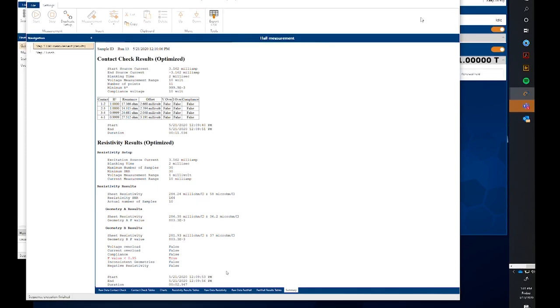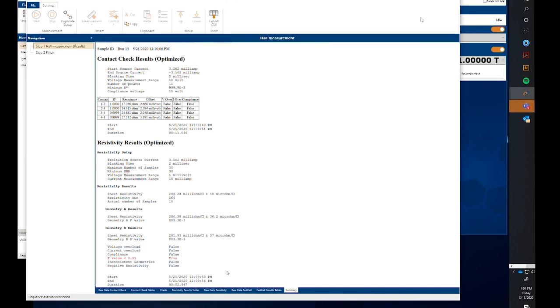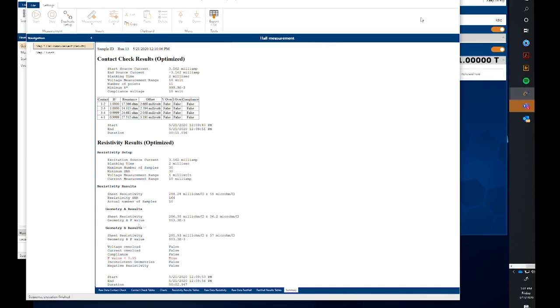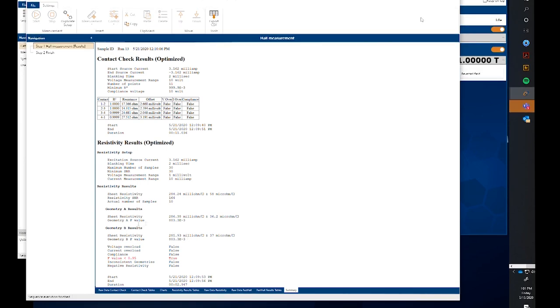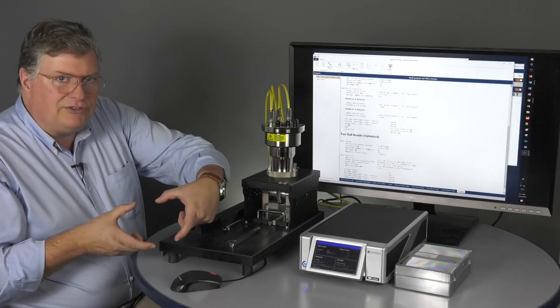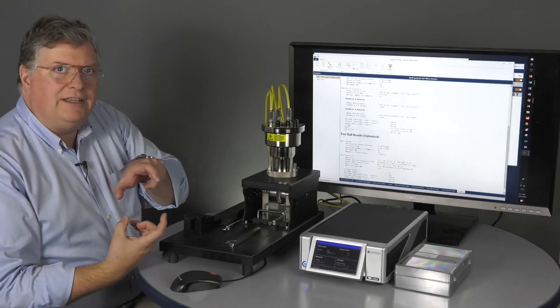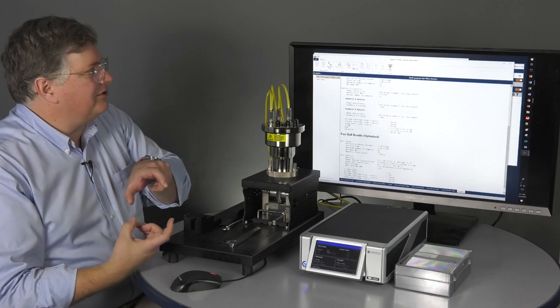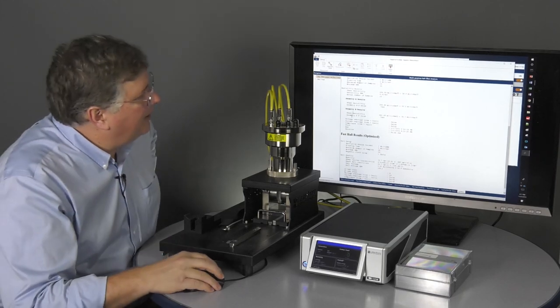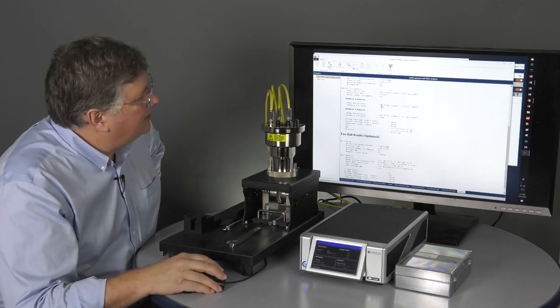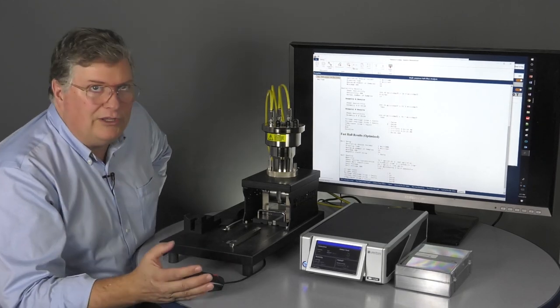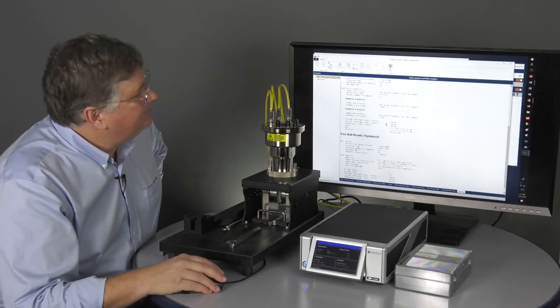There's also reporting geometry A and B results. So for geometry A, we source on two adjacent contacts and measure on the other two. And then we can rotate that 90 and get a second geometry. So comparing those two numbers, you can see we have quite uniform sample.